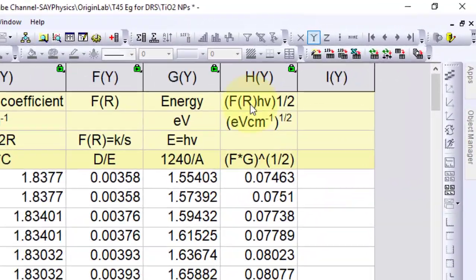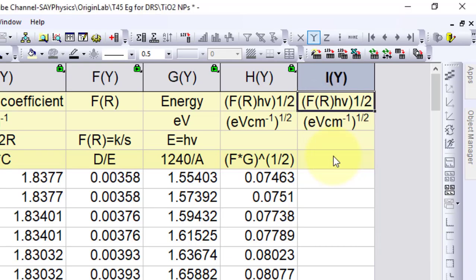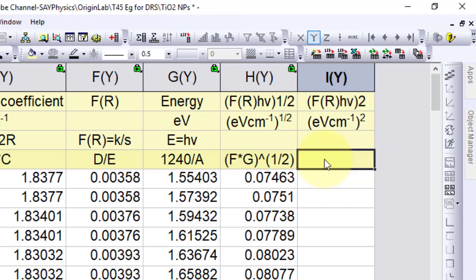Similarly, we can calculate F times energy in units of electron volt centimeter inverse with power two by multiplying column F and G with power two.